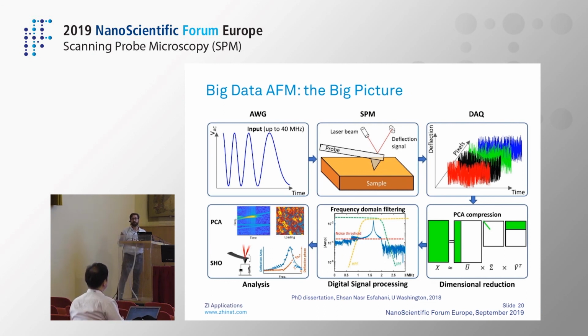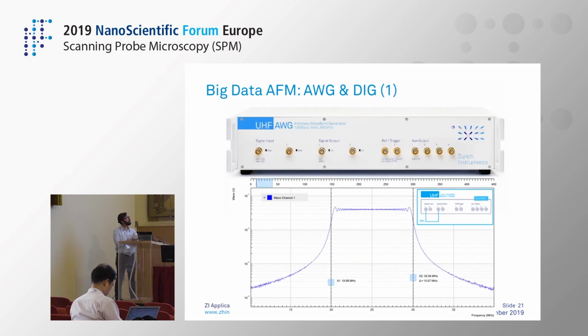Concretely, the way we do it, and we have this also outside with our UHF, is that you excite the complete band. It's just from output to input, so you have a flat band. If you now have your cantilever inside your system, you can measure the frequency response over the complete wide band.